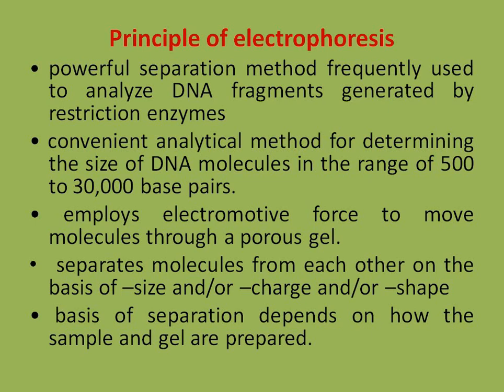It is a convenient analytical method for determining the size of DNA molecules in the range of 500 to 30,000 base pairs. So using this electrophoresis method, we can easily visualize 500 to 30,000 base pair DNA bands.